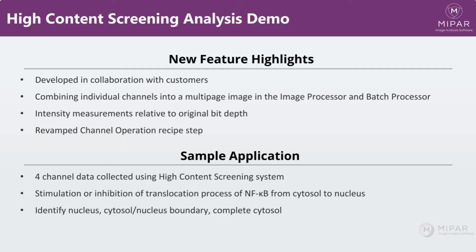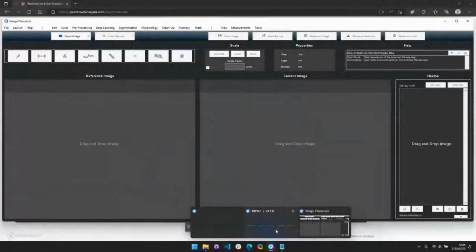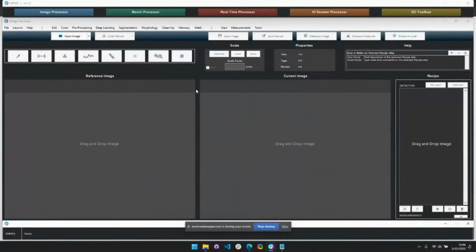So without further ado, let's go ahead and set up my screen share. Okay.